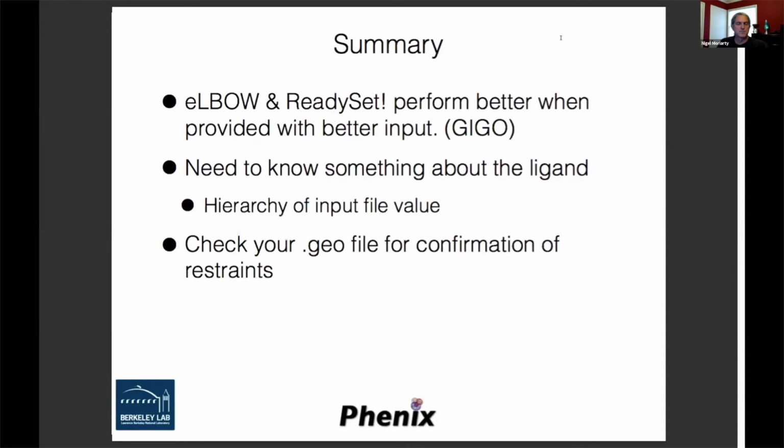So first thing I would do is run it without the metal restraints and see what happens to your metal center, because Phenix will try to do something for you automatically. There is a sub option in Phenix Real Space Refine that says you can turn on and off link metals. You should take a look and see what happens.